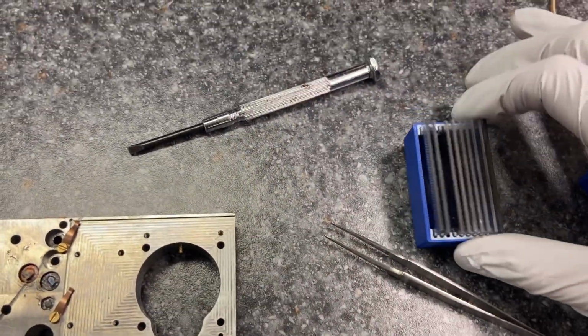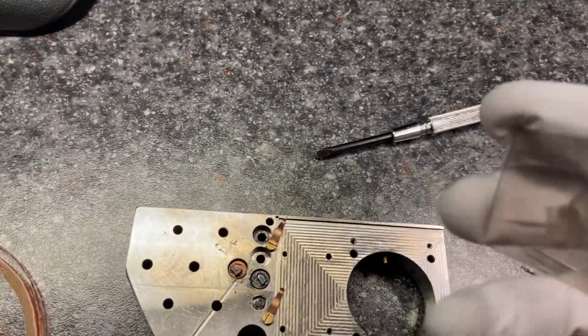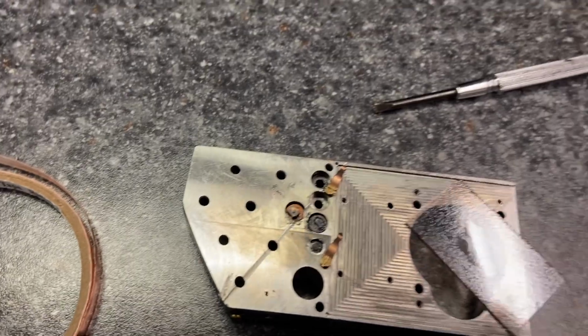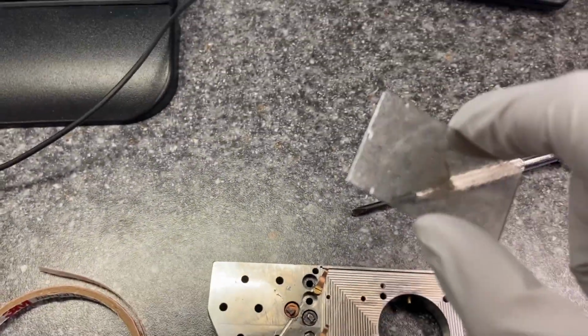And so essentially, this is my box of thin sections here, and I'm gonna be looking at these two thin sections right here. So the key thing that I always do with them is I wanna make sure that the side facing up is the side I'm looking at. And you also notice they look a little dark. That's because these thin sections have been carbon coated.